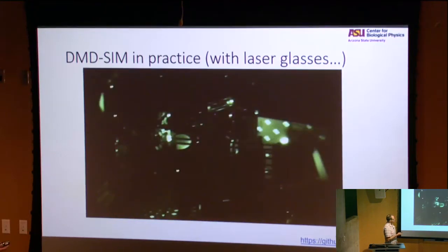Also, the other thing you can appreciate is there's a lot of orders coming off this thing that are not very useful, right? So actually optimizing this system takes a lot of work, and it's not that light efficient, to be honest. So we end up having to use multi-mode lasers and a lot of effort to homogenize the beam.